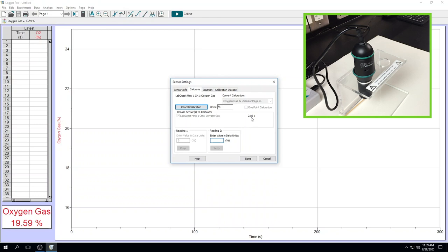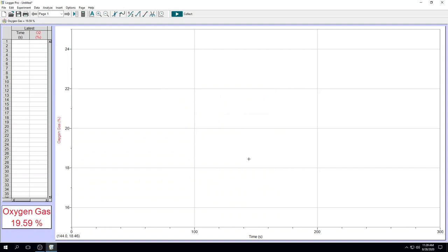At this particular case, the voltage is 2.85 volts. In reading two, enter 20.9, which is the percentage of atmospheric oxygen. Click keep. Done.